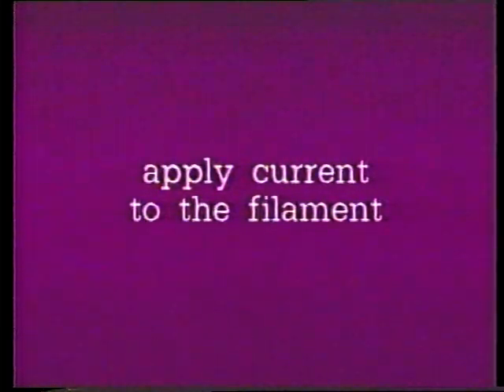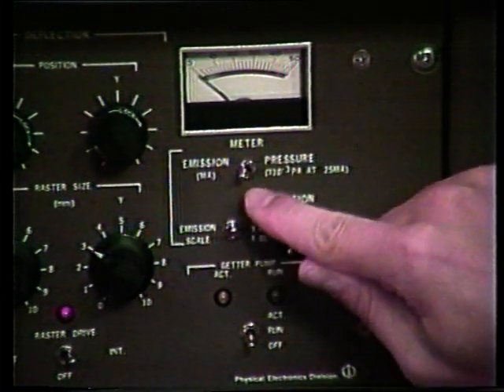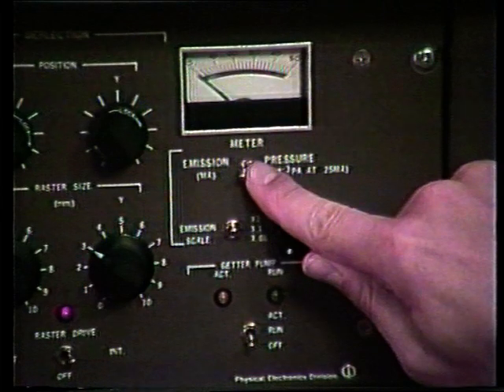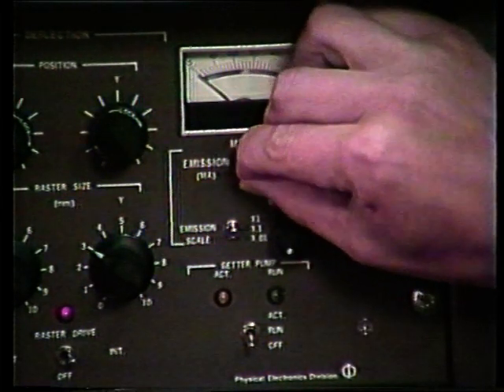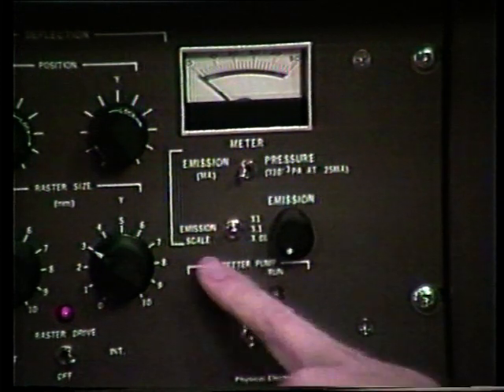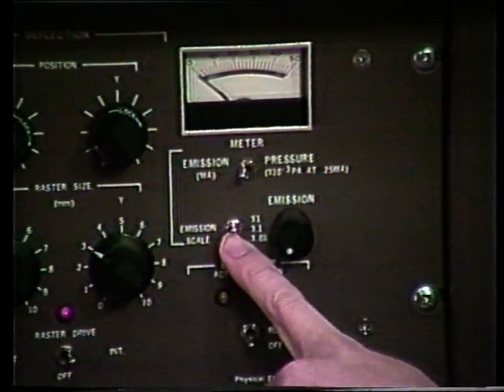We are now ready to apply current to the filament. We again want to make sure that the meter is measuring the emission to the filament, so that the toggle switch is in the emission position. We also want to make sure that our emission scale is on ×1.